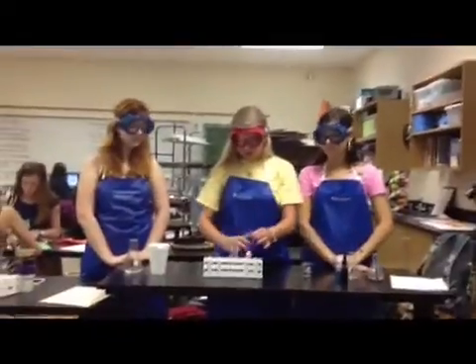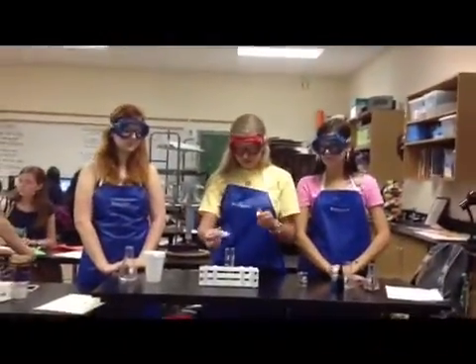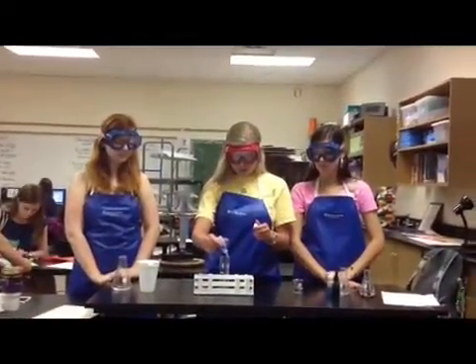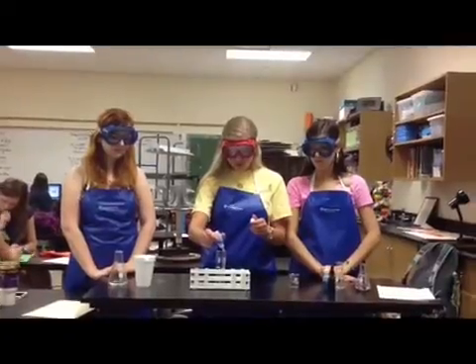Now we're experimenting with protein. This is the distilled water and this is the protein solution. We're going to put five drops of the Biuret reagent in. One, two, three, four, five.